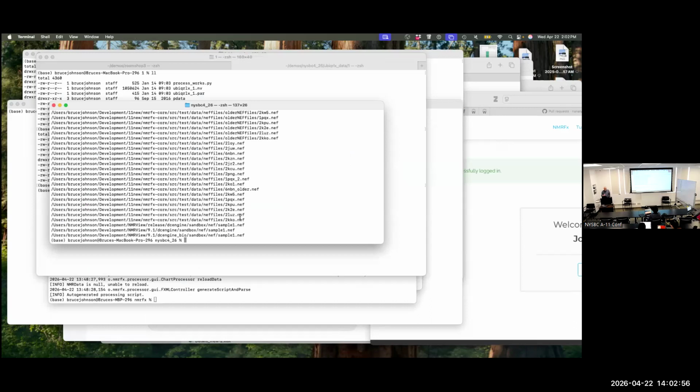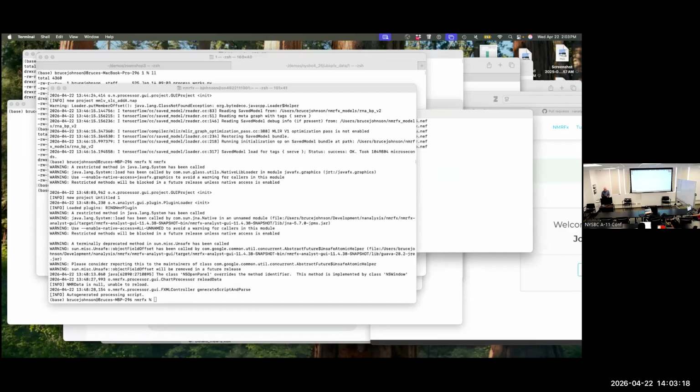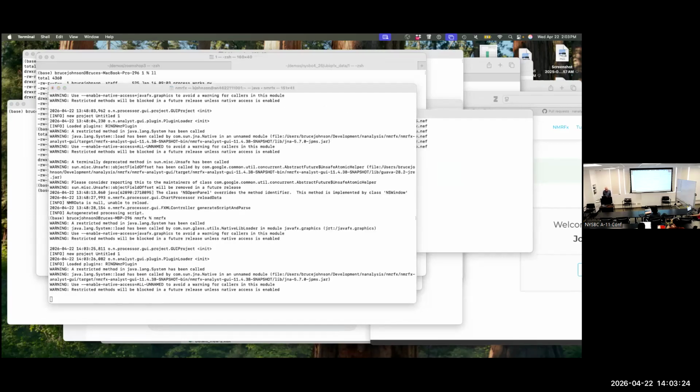Normally on Mac, you're going to install into the applications directory. I will tend to run things from the command line because it gives me a little more debugging information, because inevitably things are going to break during a demo. That's why I like to do the demos, because I'm always exploring things that I'm not doing on a daily basis. You find issues, and I can see a little bit more about what the problems are. So I'm going to start up here from my command line.